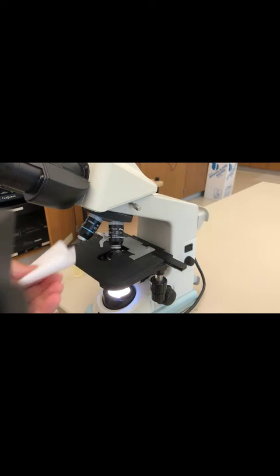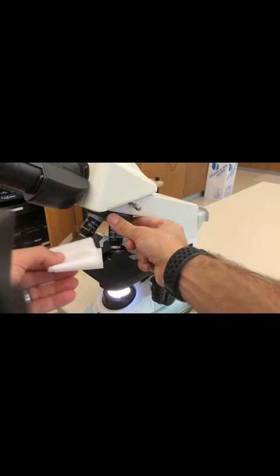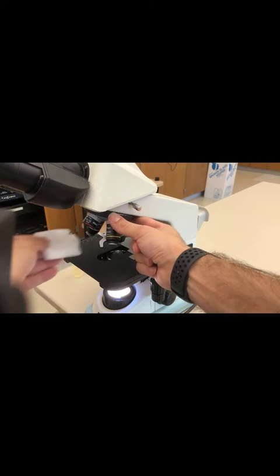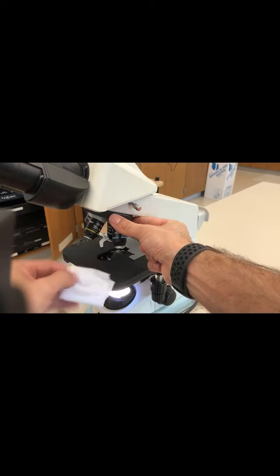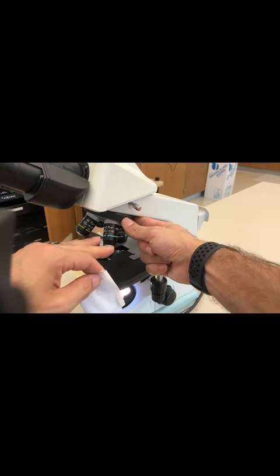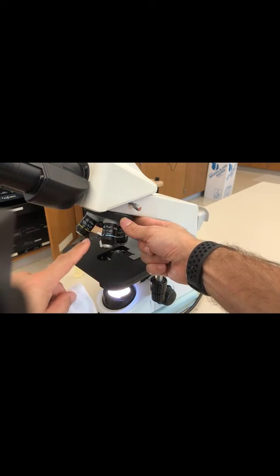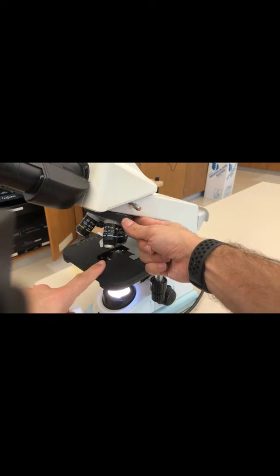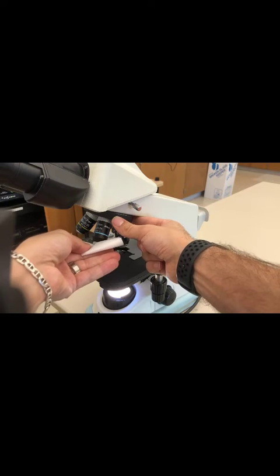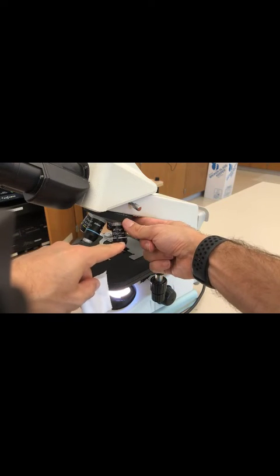What I like to do is start with the lowest objective lens, 4x. Never hurts to clean these. 10x. Next, the 40, which by the way, shouldn't encounter oil. Remember that? The 40x should never come into contact with oil, but you're going to wipe it anyway, just to be extra sure that it doesn't have any oil.